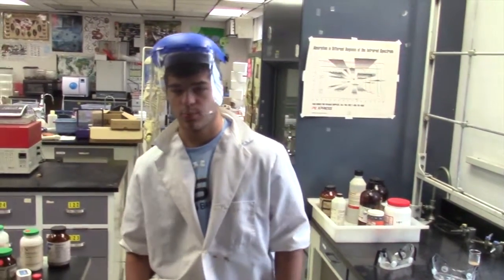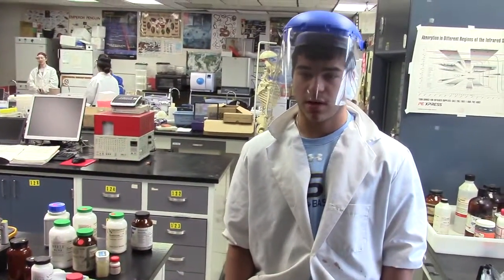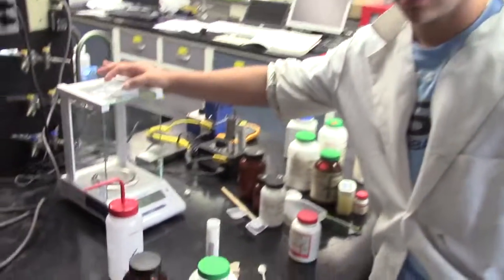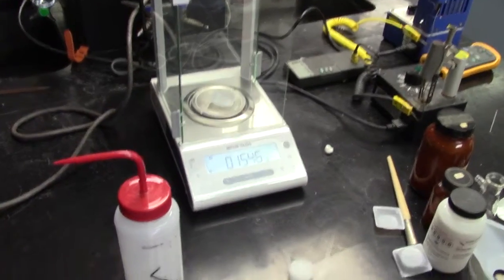So after washing your mortar and pestle and nuts and bolts with soap water and acetone, you will place them in the oven for about 10 minutes. And while they are drying in the oven, you will measure out 0.1 to 10 milligrams of your solid sample and about 100 milligrams of KBr. Now we have pre-measured out our KBr with our solid sample. And as long as you're close, you're good.